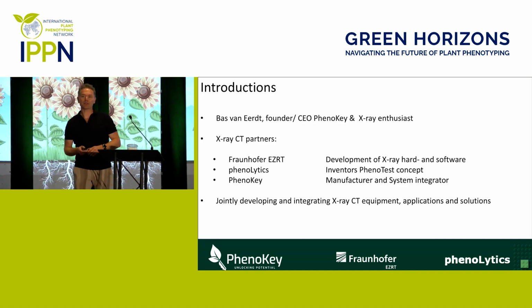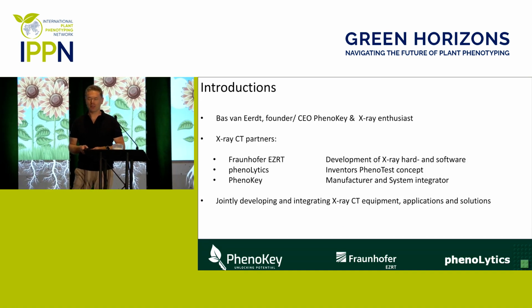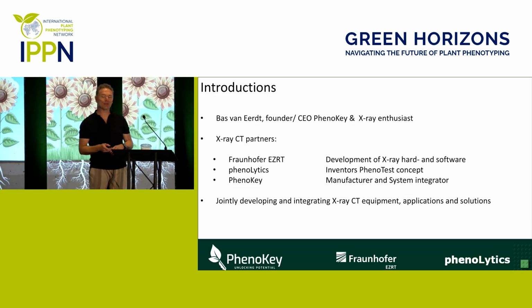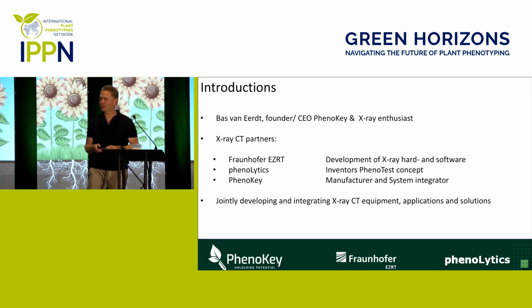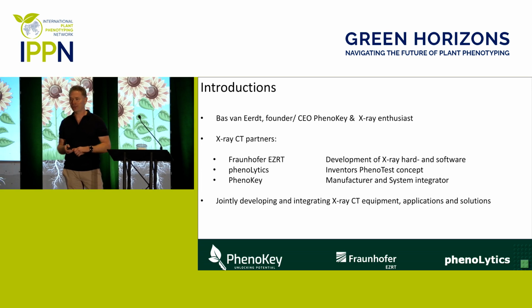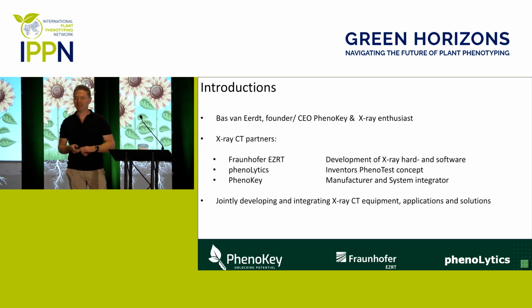So my name is Bas van Eerdt. I'm founder and CEO of PhenoKey. We're based in the Netherlands. And besides that, I'm also an X-ray enthusiast. And there's one person to blame for that. He's over there. That's Mr. Stefan Geert from Fraunhofer Institute, whom I bumped into 10 years ago on a phenotyping conference. He was presenting a paper on Xray CT and potato tubers. And then I got hooked and got more and more excited about this technology in the past years.